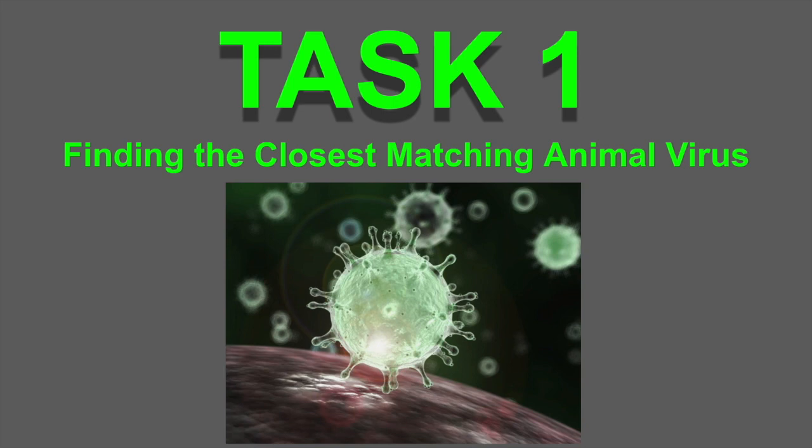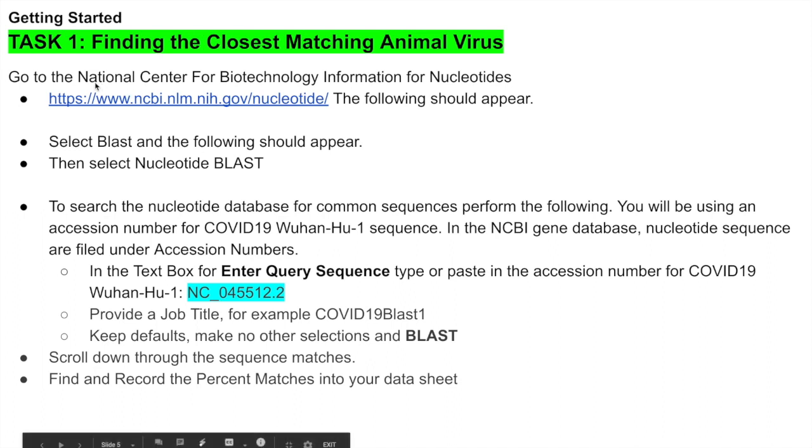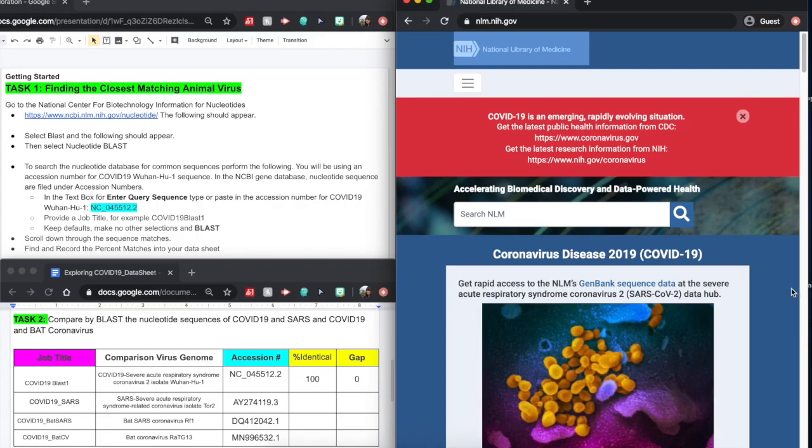In task one, we're going to find the closest matching animal virus. The first step is to access the National Center for Biotechnology Information using this website here. We're just going to copy and paste it into a new web browser.